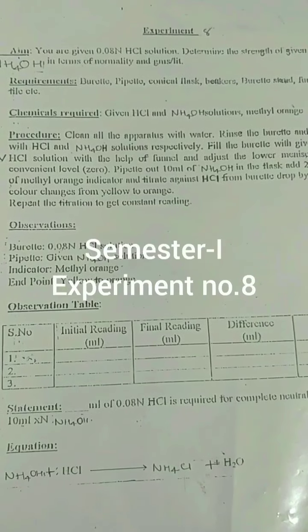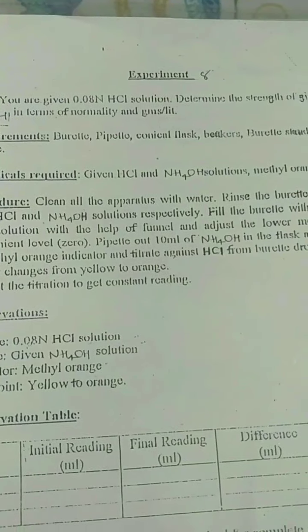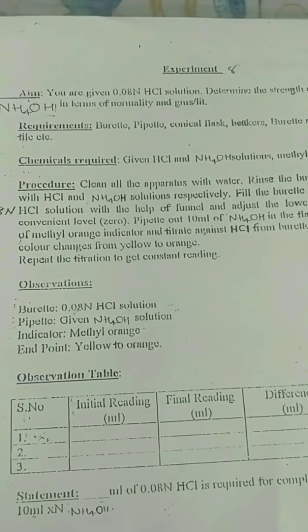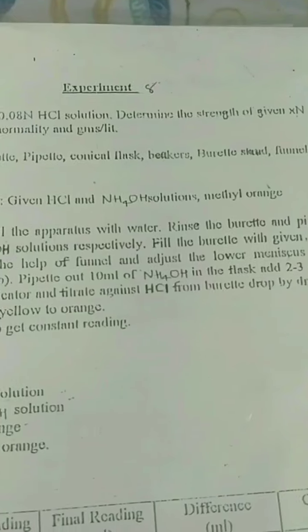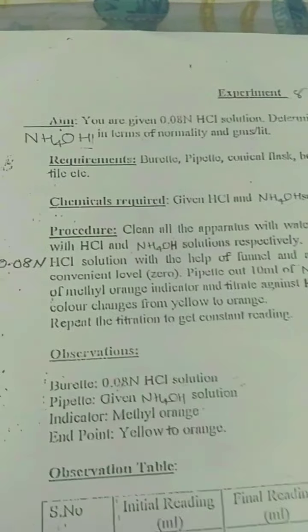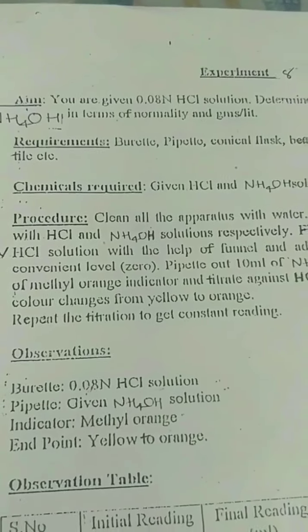Hello students, today we'll be doing experiment number 8 of our first semester. Aim of the experiment is you are given 0.08 normal HCl solution. Determine the strength of given X normal NH4OH in terms of normality and grams per liter.